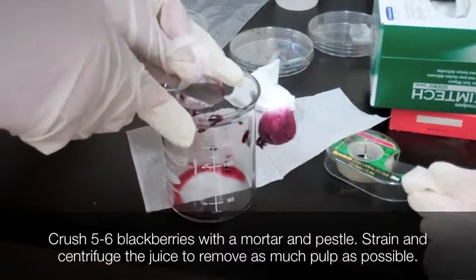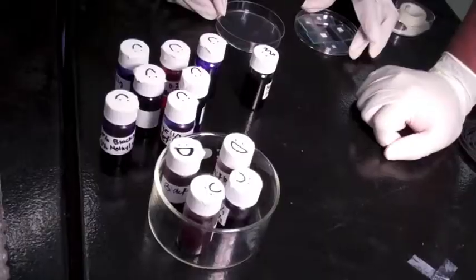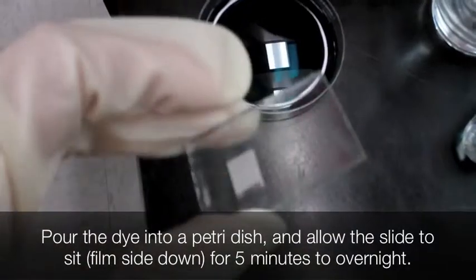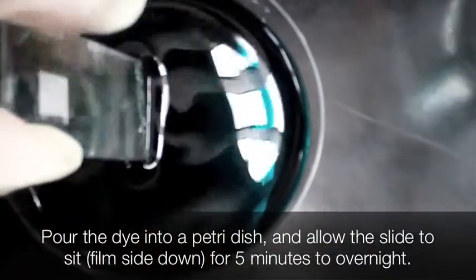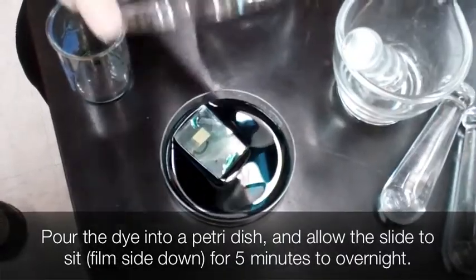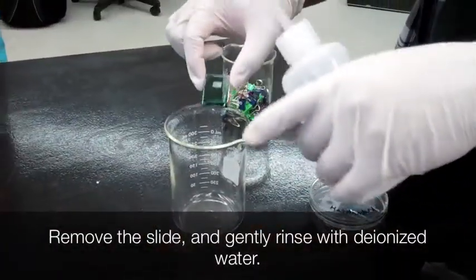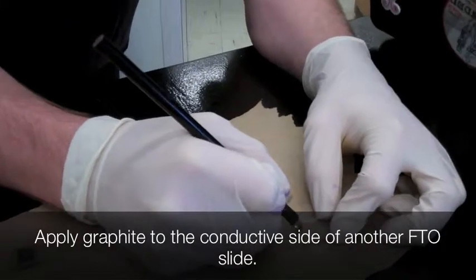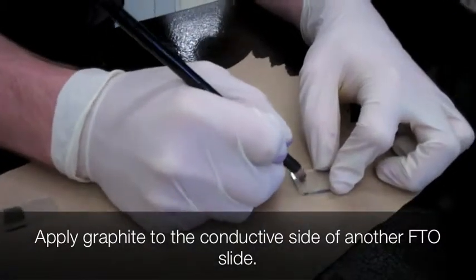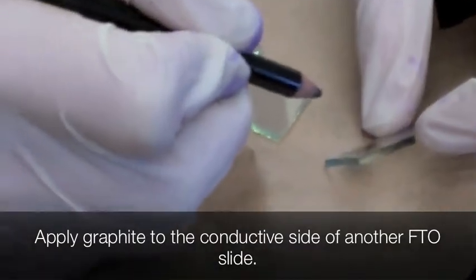To make a blackberry dye, press or juice the blackberries and then strain or filter them until it's pure blackberry juice. You can add water for increased volume. New experimental dyes can also be used. Coat the bottom of a petri dish with the previously prepared dye. Place the cool titanium dioxide film conductive side down in the dye and allow it to sit for at least 15 minutes, but preferably longer. Remove the slide from the dye and rinse with water without damaging the film. Create a small square layer of graphite on the conductive side of the FTO slide in about the same size, shape, and location as the TiO2 film.